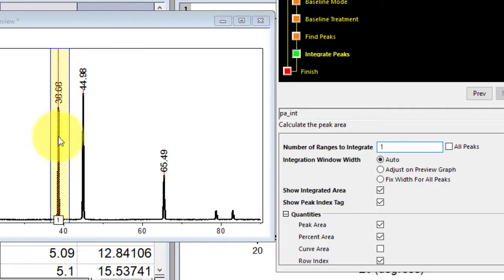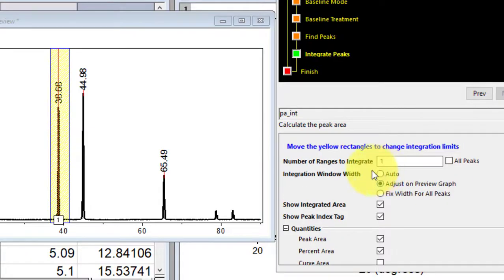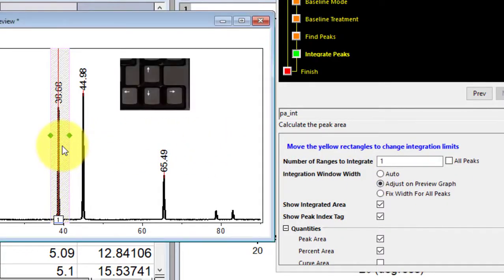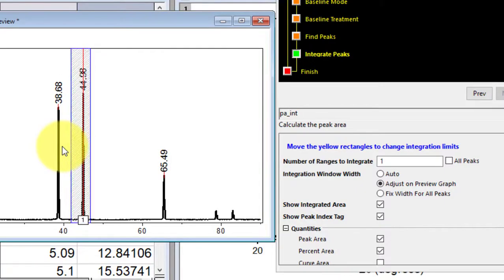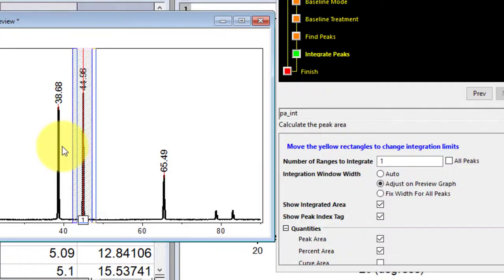Now if I want to move this one to this peak, if I am interested in this peak area, or this one, for that I will have to click here to adjust on preview graph. And with the arrows, I will now select this one, and with the arrows I can move it to this one, or to the next peak.